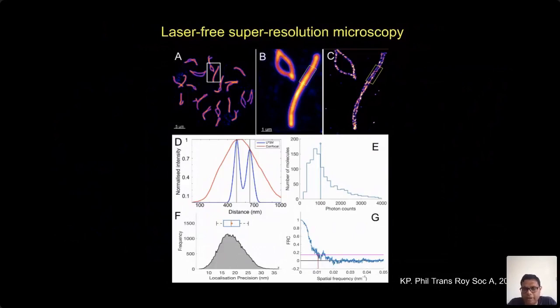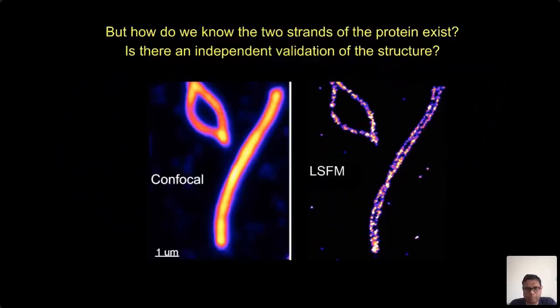So in the new, let's say, MINFLUX, SIMFLUX, DNA-PAINT methods, the new fashion is you take millions of signals, right? And then you just take highly precise molecules. And then that's how you can claim, like, so let's say if I have a precision plot like this, then I only take a population with less than 10 nanometer precision, right? Then overall, of course, my data will be undersampled, but then I will get a very nice resolution.